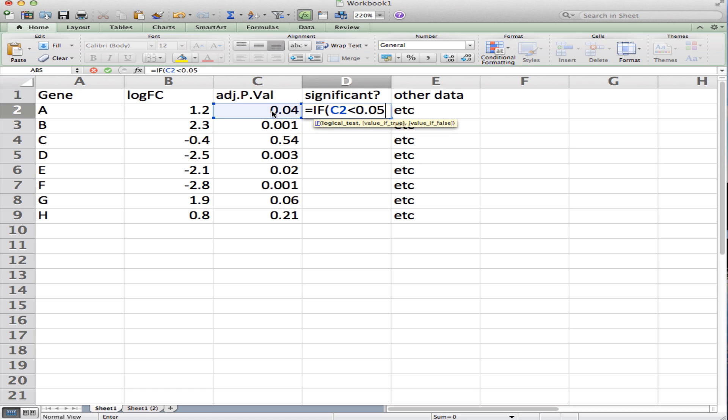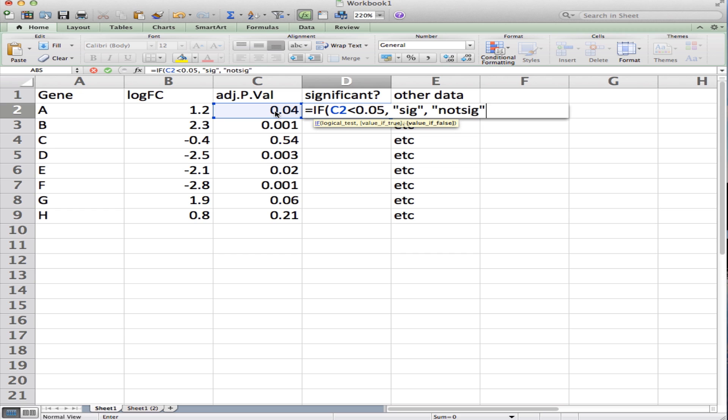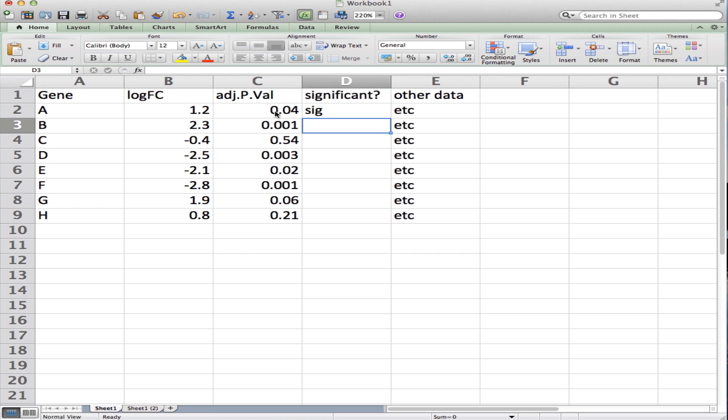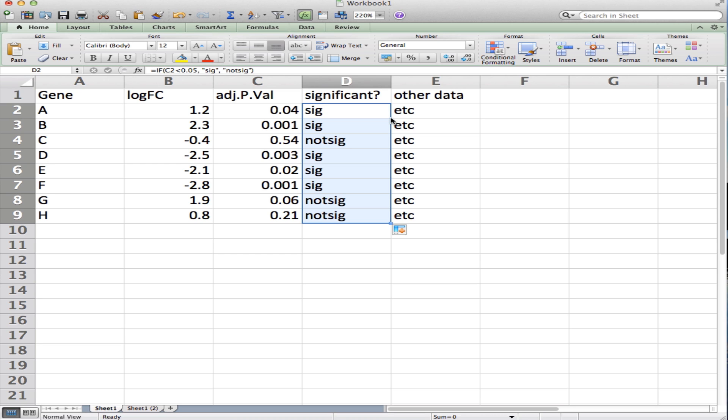The value if it's true will be 'sig' in double quotes, comma, the value if false is going to be 'not sig' in quotes, and close the parentheses and hit enter. Now this says significant because it's less than 0.05. If you double-click on the corner of this cell when it's selected, it will copy and paste all the way down to the end of the file, and you can see for each gene whether it's significant or not at 0.05.